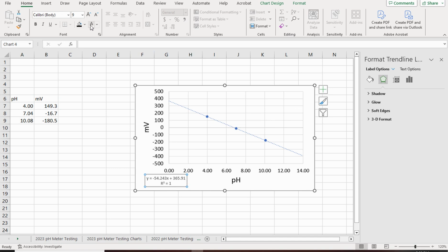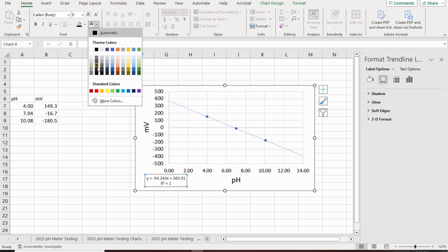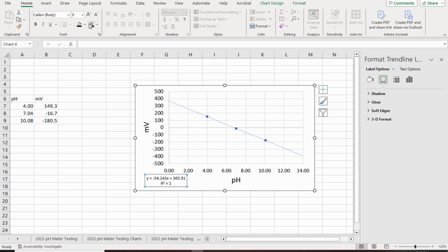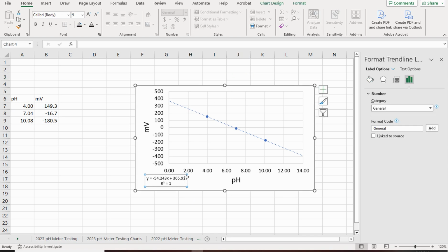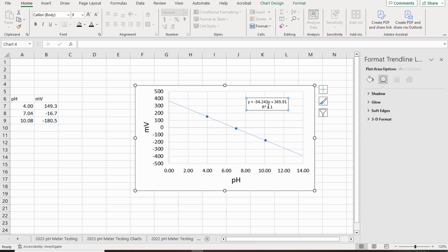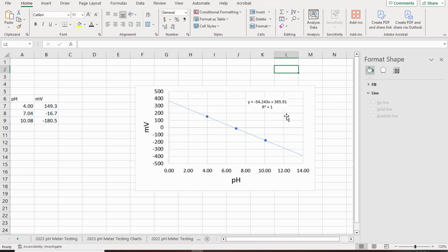And then I'm going to click on this and I'm going to make this nice and black here, make it much darker. And so what this is showing us then is, so this is a nice figure, although I do like mine up here for some reason. It's just my preference is to have it up there. So I will leave it up there.